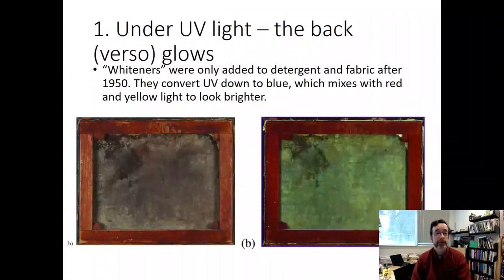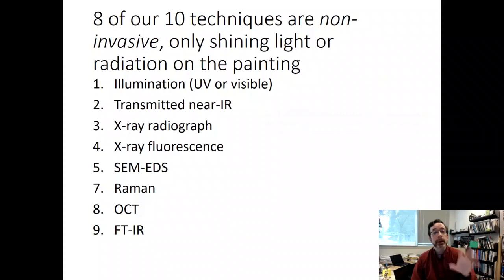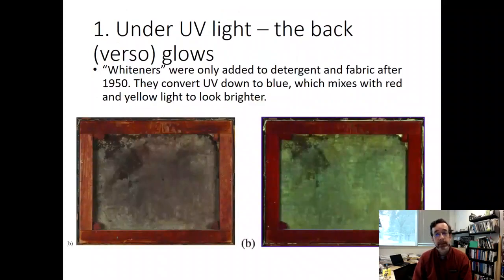It's non-invasive. There are other techniques that are invasive, where you take a paint chip. By the way, most of these non-invasive techniques, you can use them invasively if you take a paint chip and then you analyze the paint chip, like a cross-section and things like that. So this is not an either-or necessarily, but in most of the cases we're going to show you, these are non-invasive techniques. A couple of the other techniques are necessarily invasive because they have to destroy at least part of the painting in order to analyze it. It can be a small part, but it's still destroyed, and that's what matters.